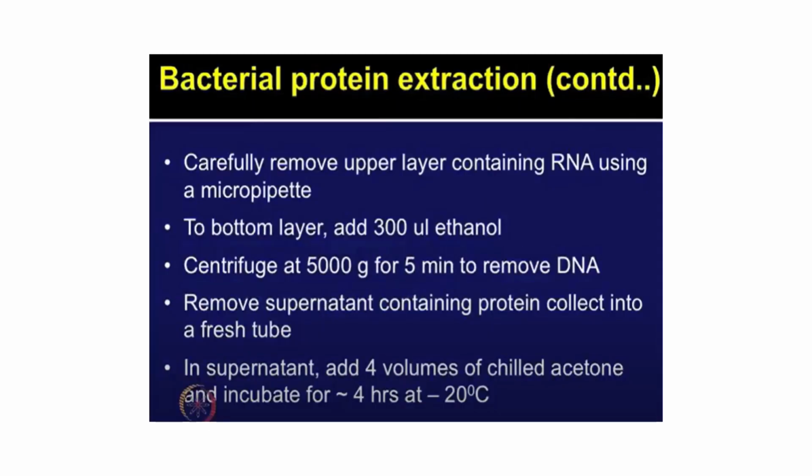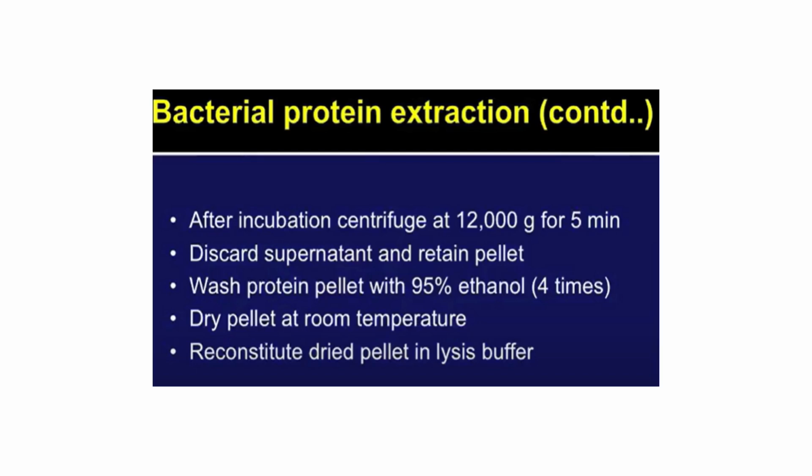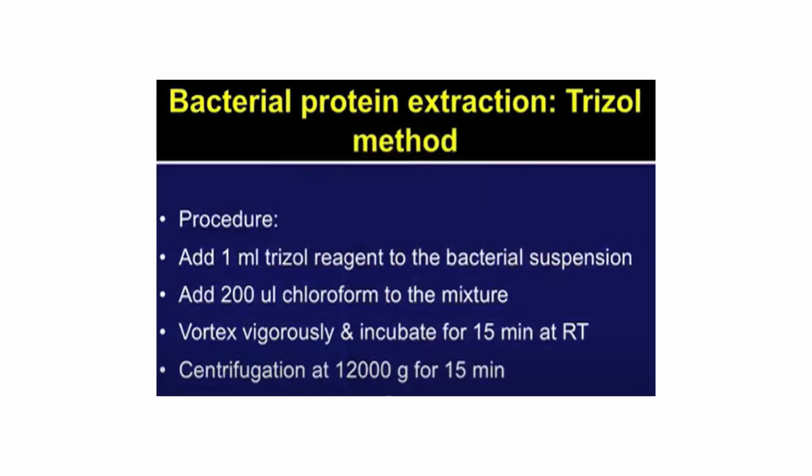So the trizol method was discussed here. This is also one of the methods by which you can do purification after lysing bacterial cells. If it is producing a certain protein and you want to study the bacterial proteome, the cells are grown, then lysed using one specific buffer; you can use sonication for lysing the cell. After sonication, you centrifuge it, and whatever is the supernatant will be treated with this trizol method so that you can extract.